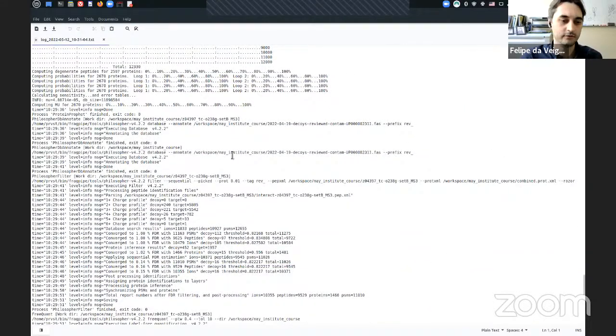But overall, even if you're not having issues, this is one of the most important output files, so you definitely want to keep those, because they will contain the information about the analysis and everything else. Even later, when you're writing your paper, you might want to come back to this file here to understand what options you used, for example.